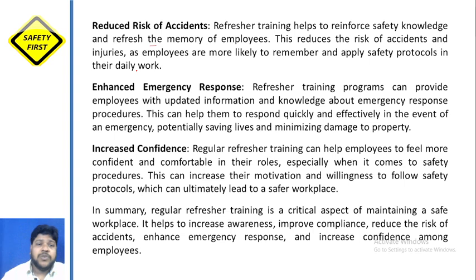When you go for some training and refresher training course, the memory of employees gets improved. And at the time when there is some emergency, some accident, this could be very, very crucial. At that time, when you do the right thing, it can save a lot of resources, a lot of people. This reduces the risk of accidents and injuries as employees are likely to remember and apply safety protocols in their daily work.